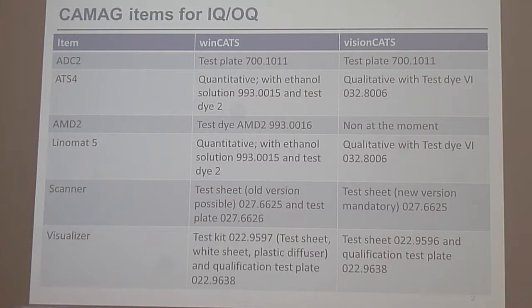They put some ink on it, and then with this level meter they say, okay, it is okay or it's not okay. It gives you the percentage of red, green, and blue. It's similar to how they check the lamps, if both sides have the same intensity. I will ask for a picture. They developed this in Brazil. With different concentrations, from less concentrated to high concentration, they check if it's good or not and just change the lamps. So I asked, can I offer some OQ? And they said, no man, we do our stuff here.